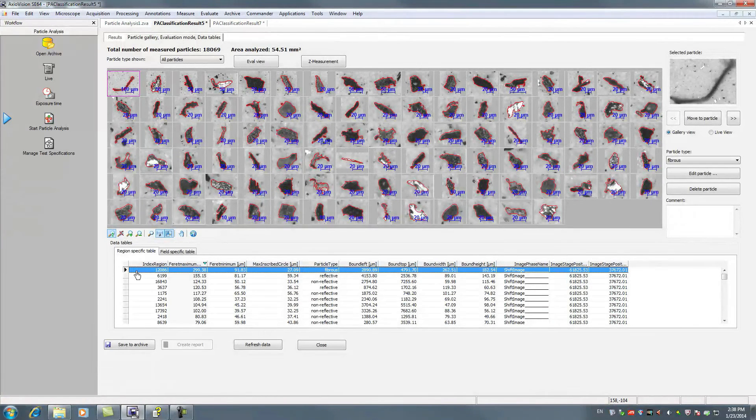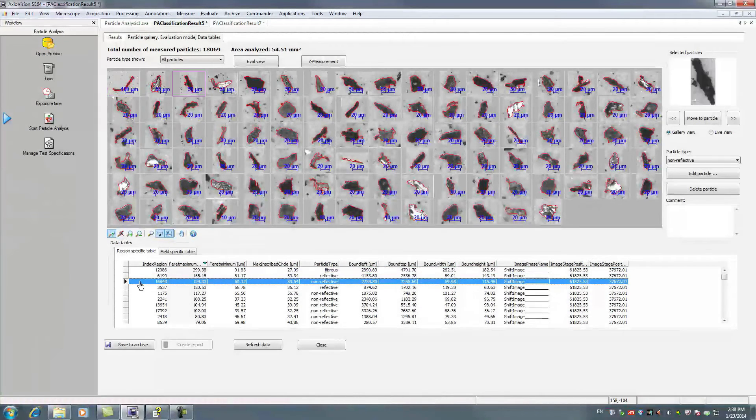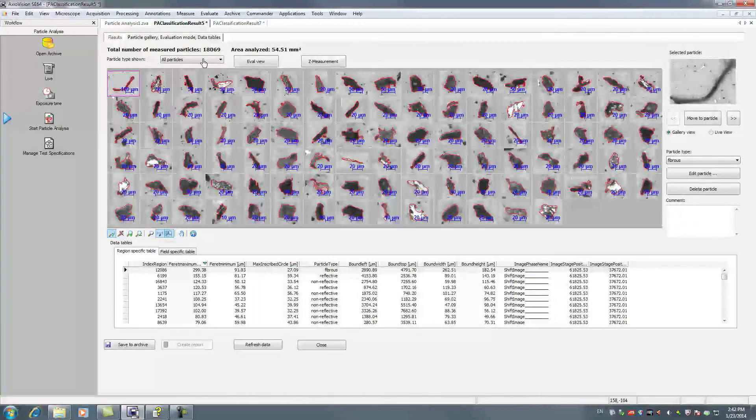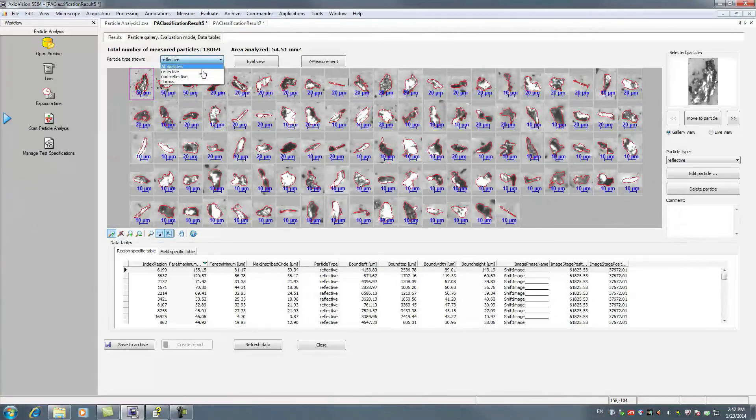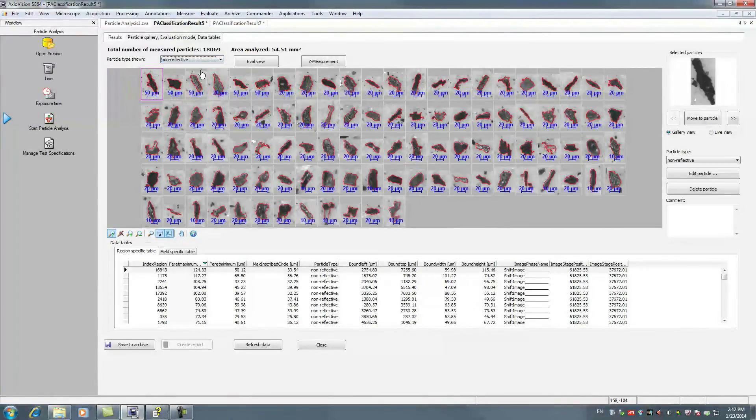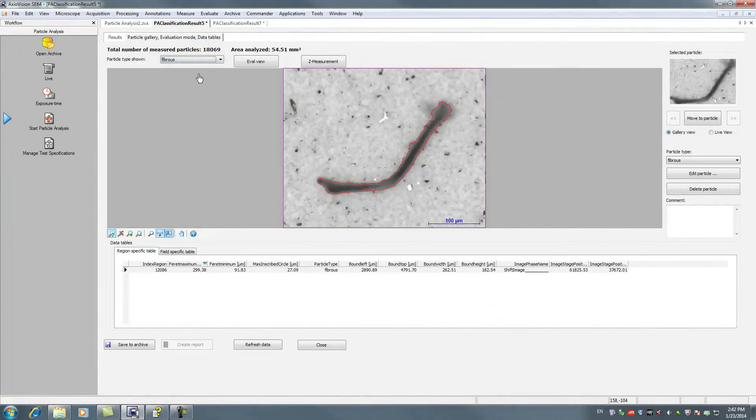In the gallery and evaluation view, you gain a quick overview of all detected particles by type. Reflective, non-reflective and fibrous.